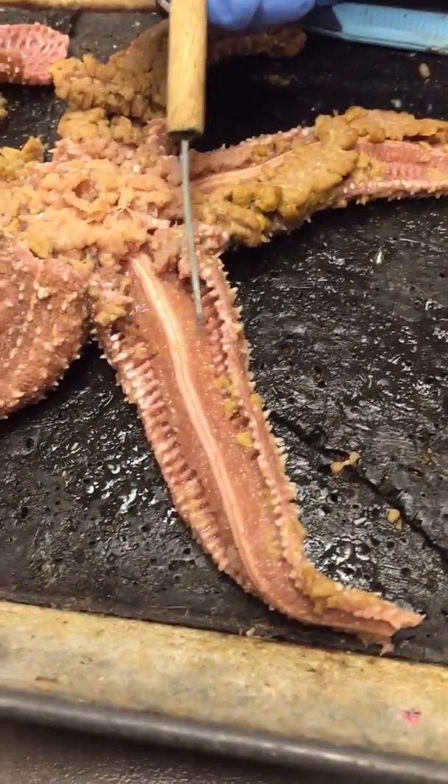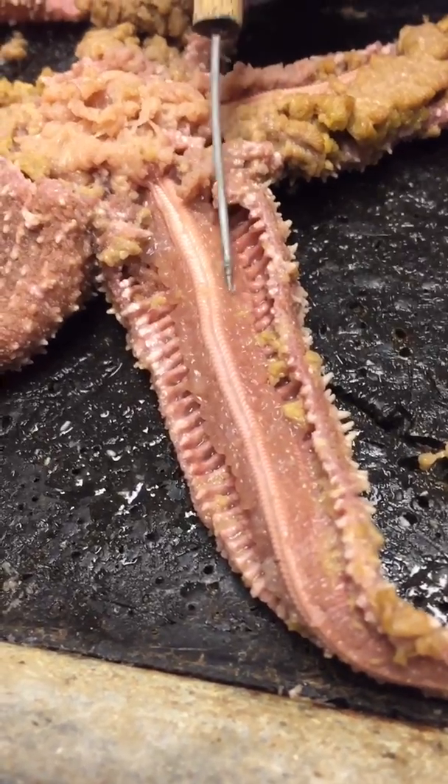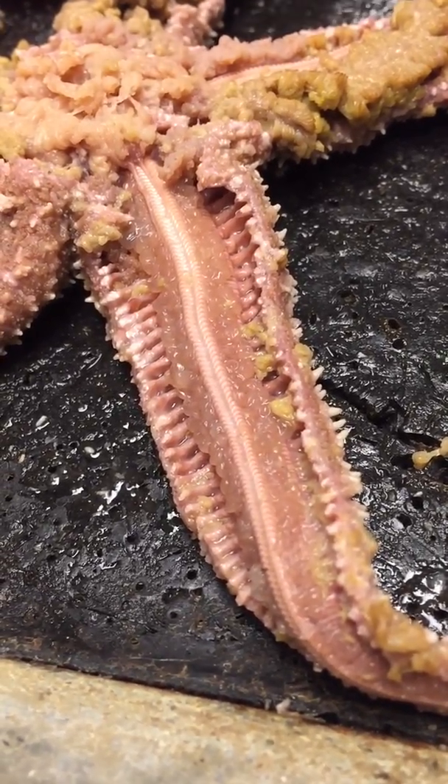The ampullae are these little squishy, egg-looking things. And that's it.